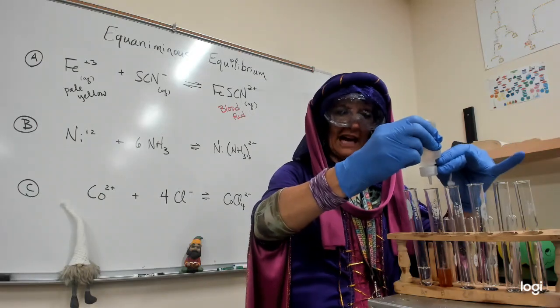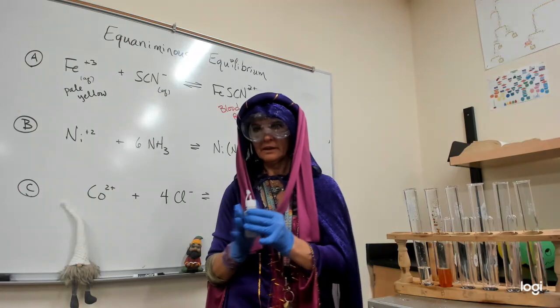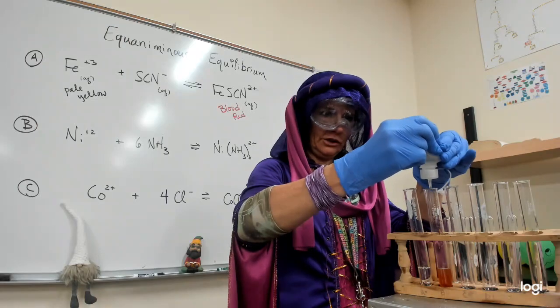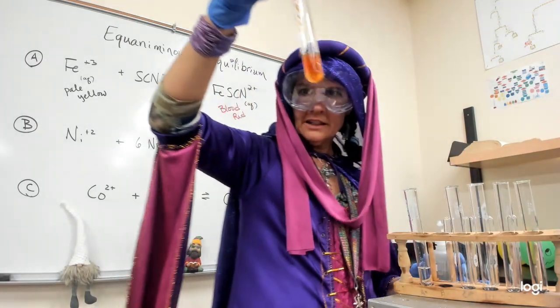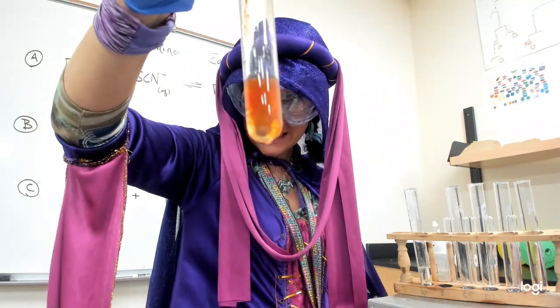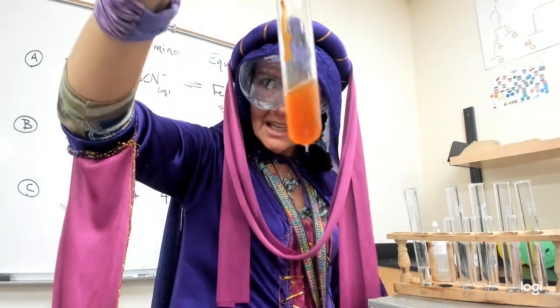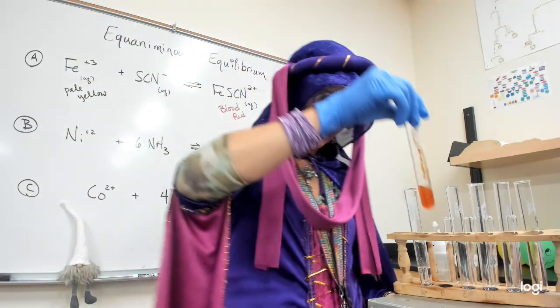So even though the hydroxide's not part of this, oops, we got it plugged. It's like live action, high quality. It's plugged, there we go. And so it's kind of cool. You can see the iron thiocyanate, the product, is hanging out there. And then as we swirl it, not over my computer, hopefully. Oh, we've definitely turned clear.